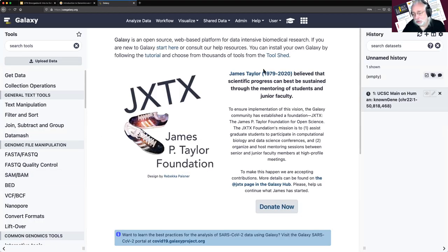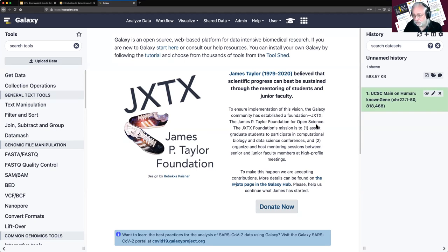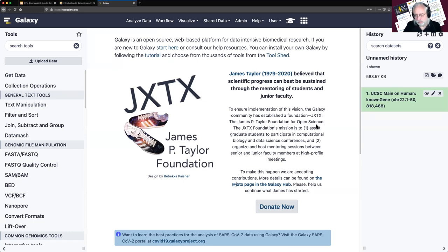Now I'm back in Galaxy. We saw a big green box, then a gray box, then an orange box, and hopefully it will go green. The big green box means the handshake between UCSC and Galaxy was successful. Gray means it's been scheduled but not running yet. Peach/orange means it's actively getting data from UCSC right now. And green means we think we successfully transferred the data. You'll see this three-step process of gray, peach, green as jobs run.